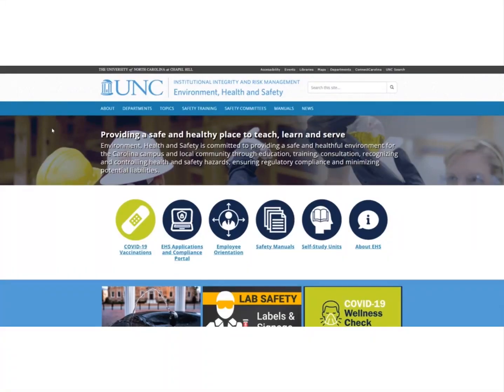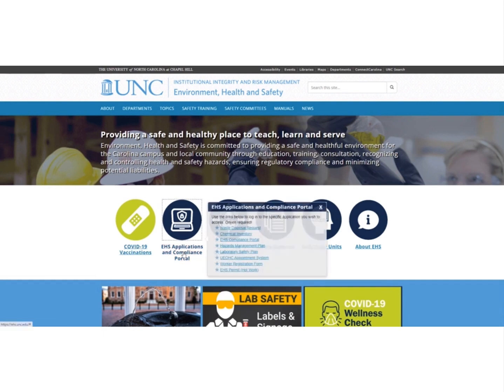Hello and welcome. In this tutorial, we are going to walk through how to update your laboratory safety plan. To begin, navigate to the Laboratory Safety Plan web application. You can access the application from the EHS homepage under EHS Applications and Compliance Portal, Laboratory Safety Plan.